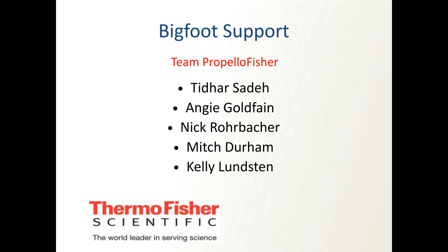So right now, in a perfect world, and we have one group that's doing it, they're trying to do everything with cellular controls. But in some recent experiments, we've done it with cellular and beads, and looked at it both ways, using the beads as the unmixing control and the cellular, to see whether it affects the unmixing of the controls. And that's what I'm working on right now.